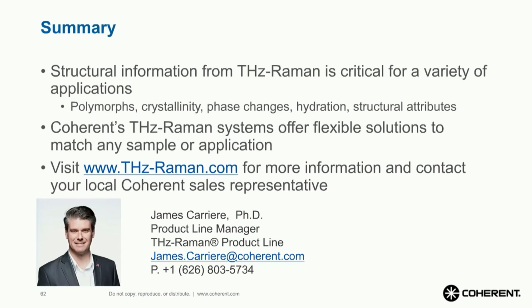So just to take away from all of this, I'd like everybody to understand that the structural information that you are able to collect with the THz-Raman, the full capability accessing the low frequency portion of the spectrum, is really critical for a variety of applications. Anything where you're wanting to access the structural information about the materials, whether it's polymorphic form, crystallinity, changes in phase, or hydration, any of these things will affect the low frequency portion of the spectrum first and foremost. And so having this capability can really expand your understanding of the system.